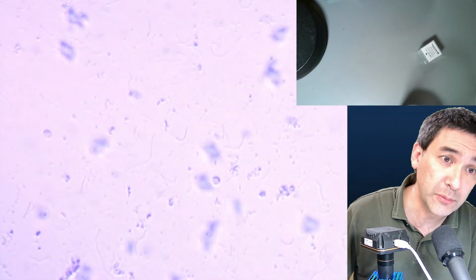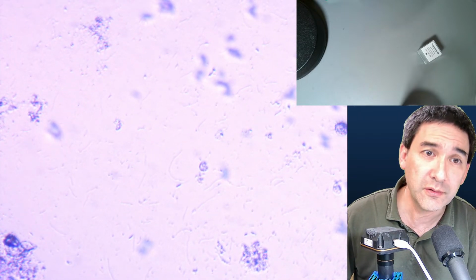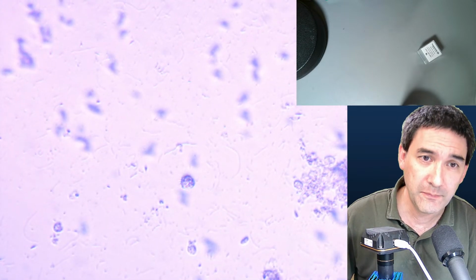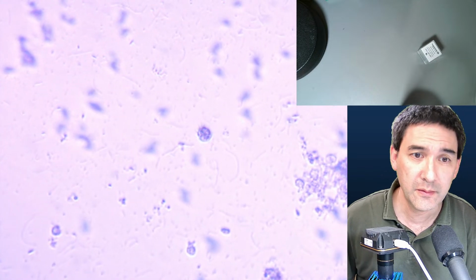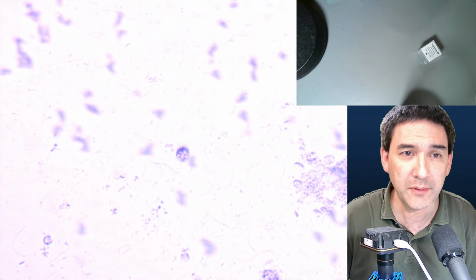Up, and now I bumped against it. That's always, of course, a problem. Yeah. Lots of bacteria are in here. But you see that I'm moving the lamp now a little bit.